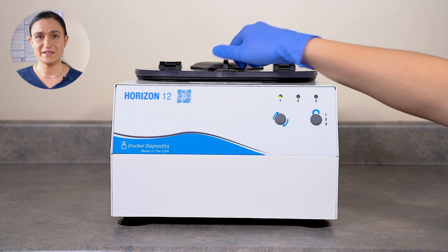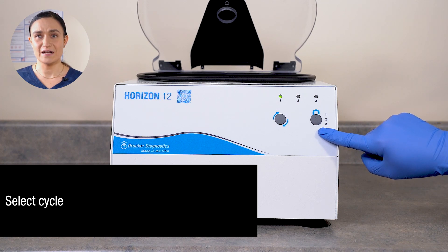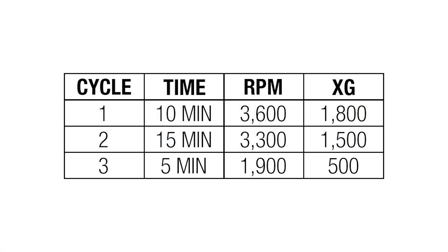With your tube holders in place and your samples loaded and balanced, you're ready to spin. With the lid open, use the stop/unlock button to select your desired cycle. In our case, we're going to run cycle 1. This cycle has a factory default of 10 minutes at 3600 RPM, which is 1800 XG. The other default presets are listed on your screen now for easy reference. Keep in mind, these can be customized to your lab's preferred spins if desired, but this is what will be programmed into the Horizon 12 when it arrives from the factory.